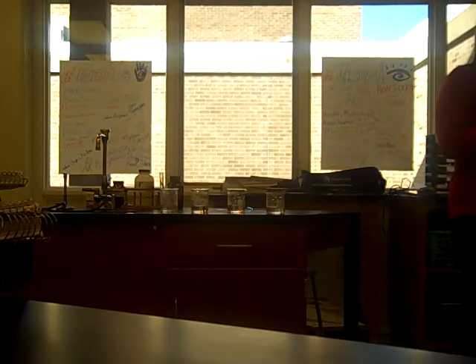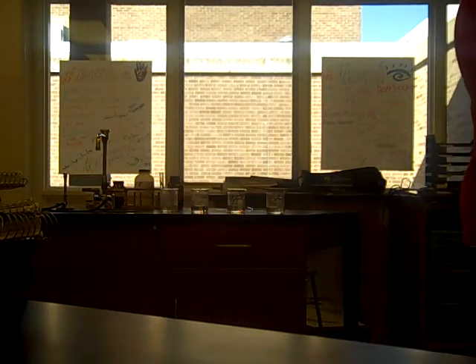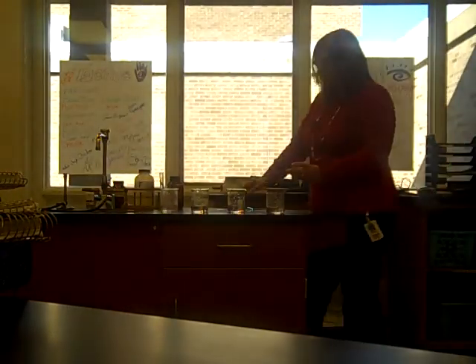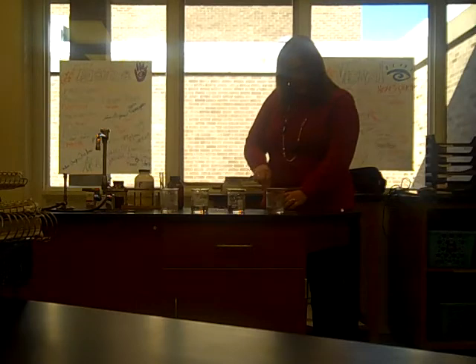Sodium is the silver on the inside of this oxide. Just like rust - iron rust - sodium rusts a lot faster than iron. See, it's silver, shiny, metallic, just like lithium. And it's also soft because I just cut it with a spatula. It's very similar to lithium because that's why they're in the same column together - because they have similar properties. So let's see if the reaction with water is similar.